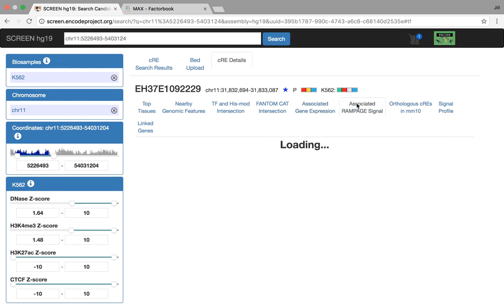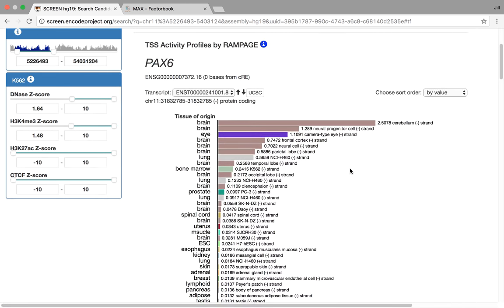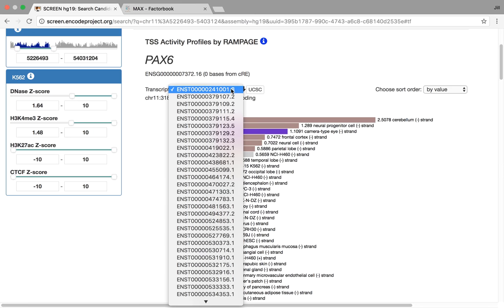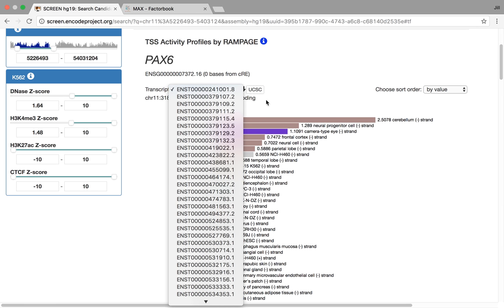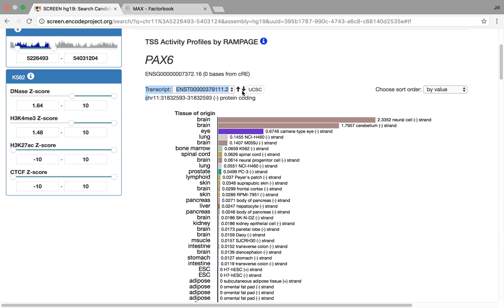Similarly, for TSS activity, we have some RAMPAGE data, and we also are displaying this here now. If you have multiple TSSs, you have multiple transcripts available, you can scroll through these and also change the sort order and how you display these too.